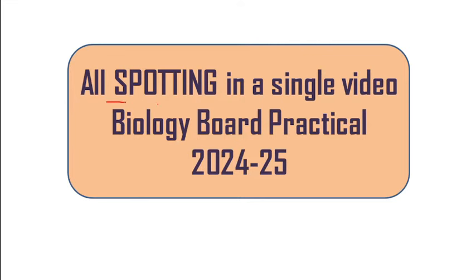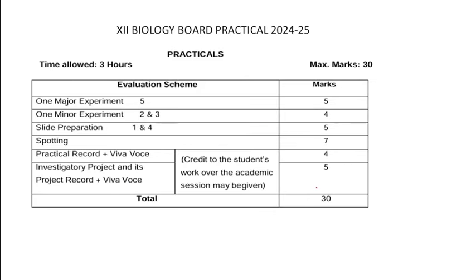Hello students, in this video we are going to discuss all the spots which are going to come in your Biology Board Practical Examination 2024-25. Before we start with the spotting part, let me give you an overview of the entire practical.